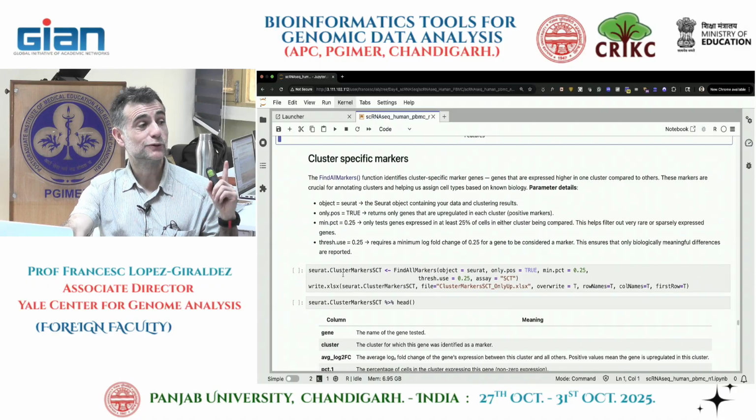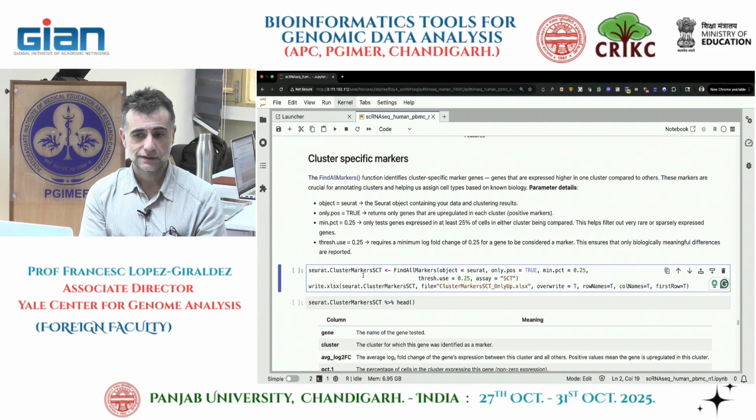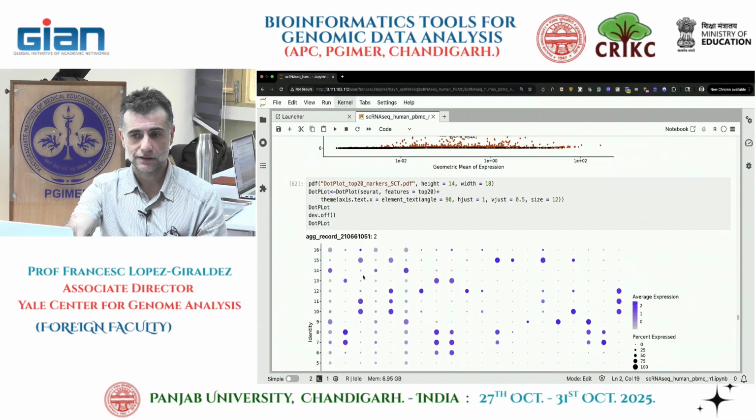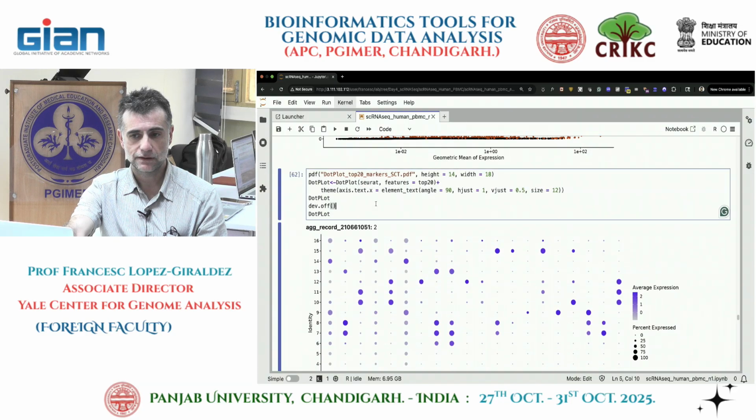So one thing we could do before we leave for lunch is to run the next step, and then I'll explain it. Because this may take also, I don't know how long it's going to take, just in case. Can you show the command you used to put the dot plot? The same, right?